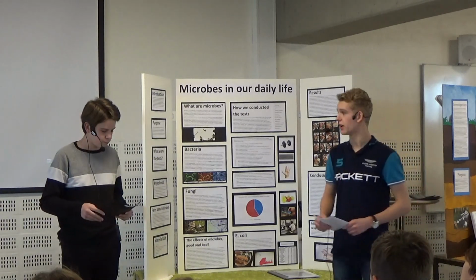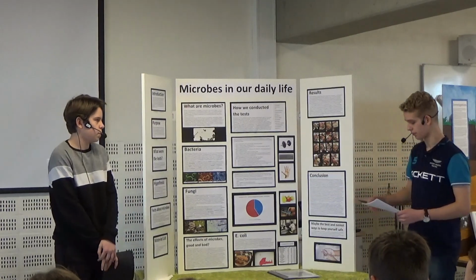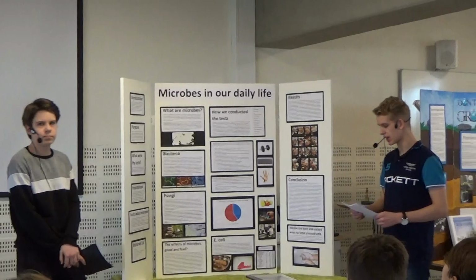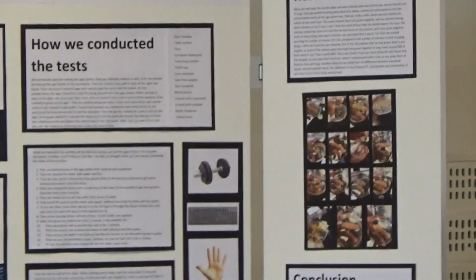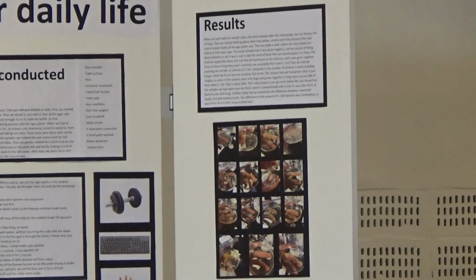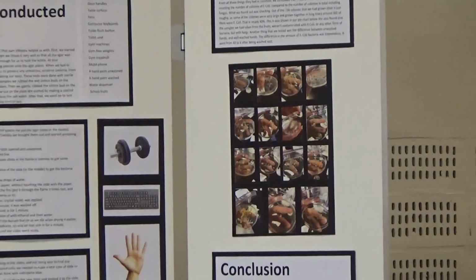So first we had to take pictures of them, like these, to document what we had grown. Then we had to clean slides with fire and paper to make them clean. And now we have a little video to demonstrate how we gram stained, to test if they were gram positive or negative.